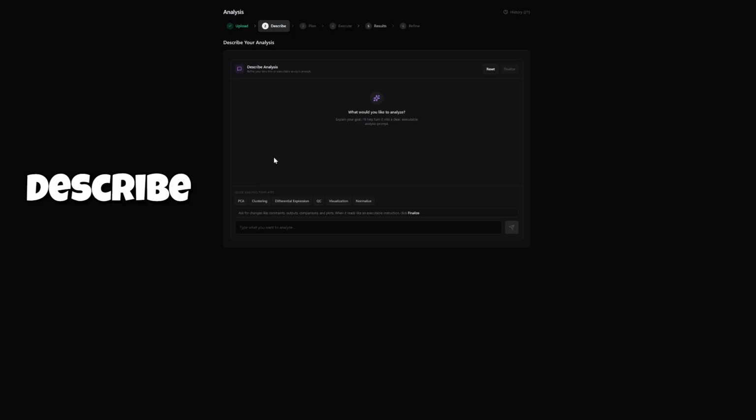So here's where I'll describe what I want to analyze, and the AI will help refine my prompt to make it more precise. If I have any questions on what type of analysis I want to do, here's where you're going to ask your AI. And we also have some quick analysis templates as well. So let's ask our AI the analysis that we want to do for our mouse brain dataset.